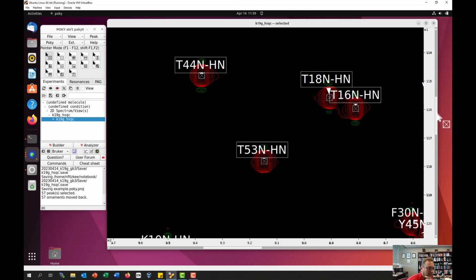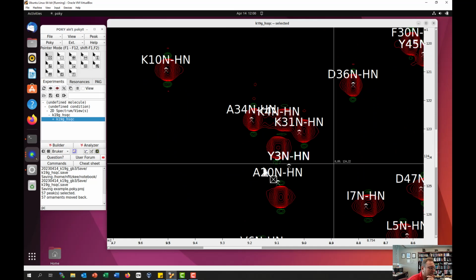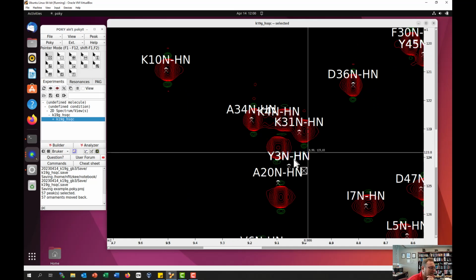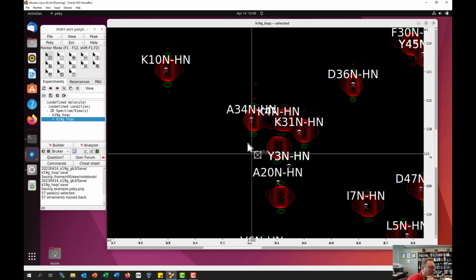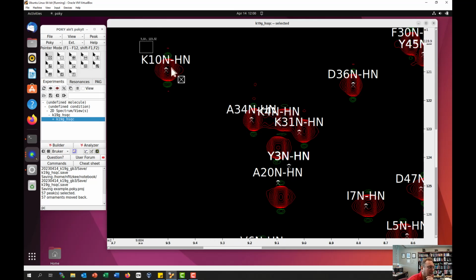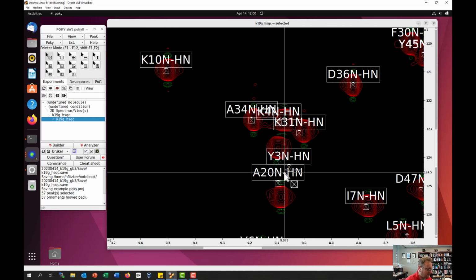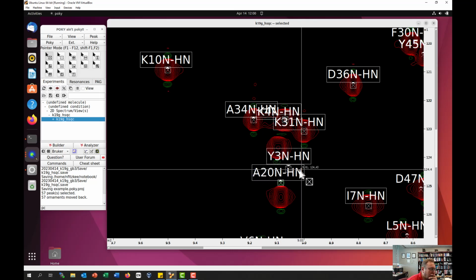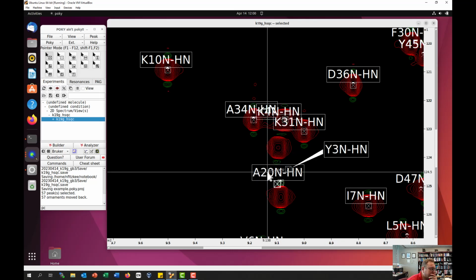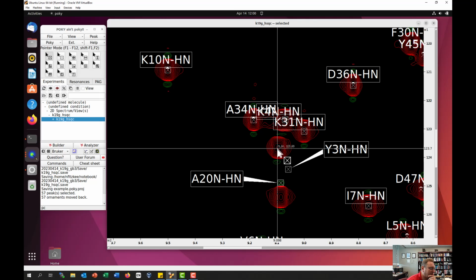correct. But on the other hand, for some of the more crowded areas, maybe I'm not going to get them correct. Or maybe by over-centering, I'm making an approximation that's not really valid. So for these, I'm probably just going to keep doing it. But notice if I do PC, again, Y3 jumps to what's ostensibly a local maximum here, but it's probably not this Y3 peak here.